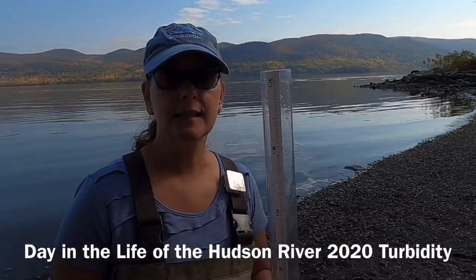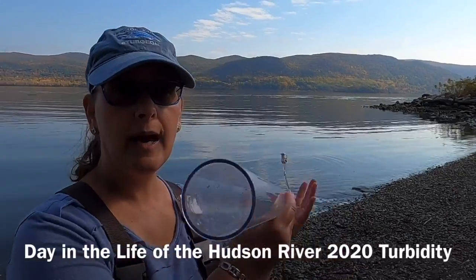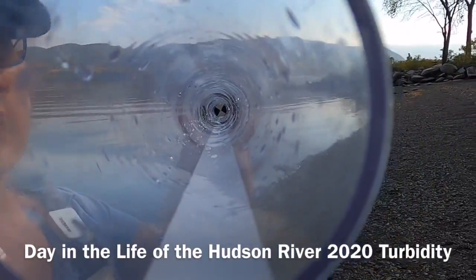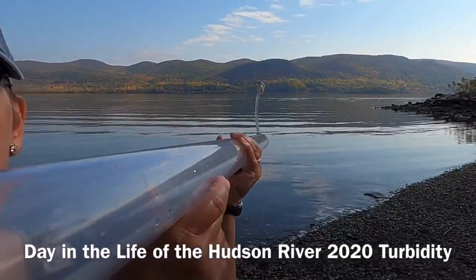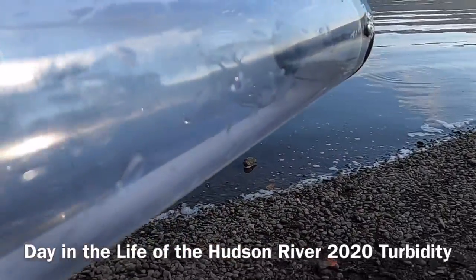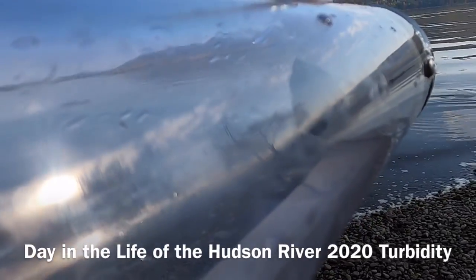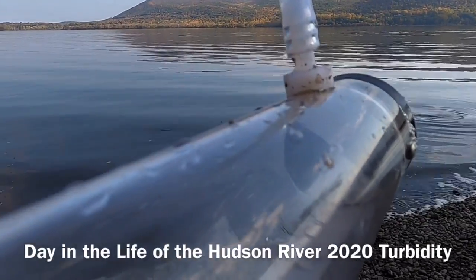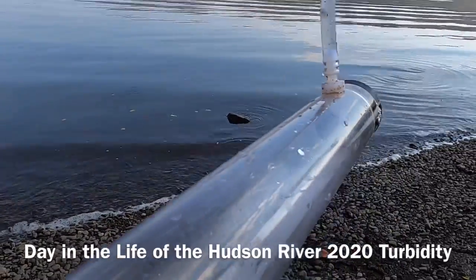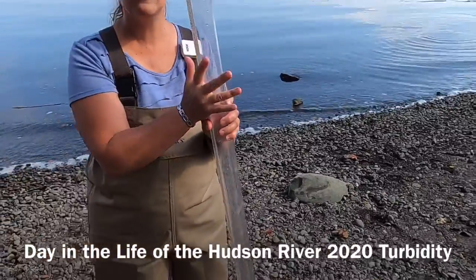A Secchi disk is divided between black and white, and we have a Secchi disk at the bottom of this tube. Now, if we were doing turbidity off up here, then our Secchi disk would be much bigger. It would be attached to a rope. That rope would have measurements on it. And as you put it down, as soon as you could not see the distinction between the white and the black, then that would be your marking, and you could do it. This tube works a little bit differently.